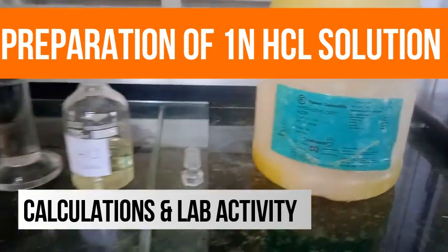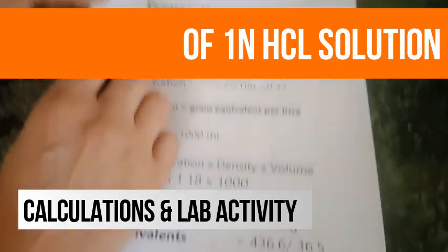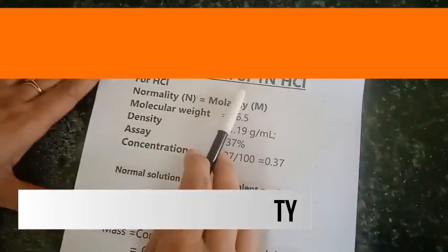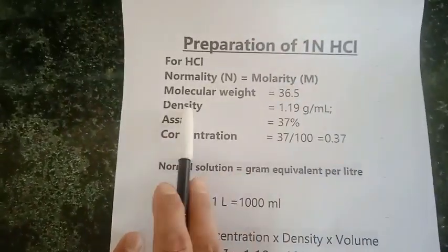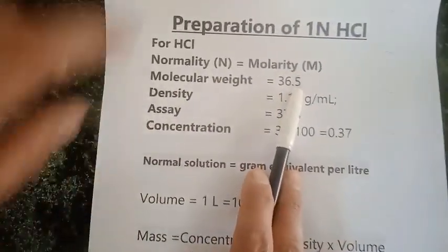For that purpose we are first doing the calculation and then I am going to prepare one normal HCl from the concentrated HCl solution. So here I have written normality is equal to molarity for HCl.